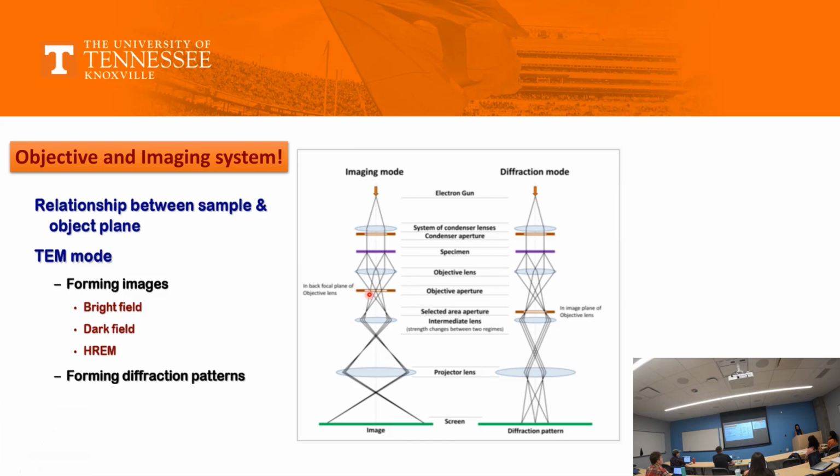This is a particular plane here that you would be keeping a lot in mind while forming an image, because it is the place where you can choose both your diffracted beam and your image beam and try to do the analysis as desired.